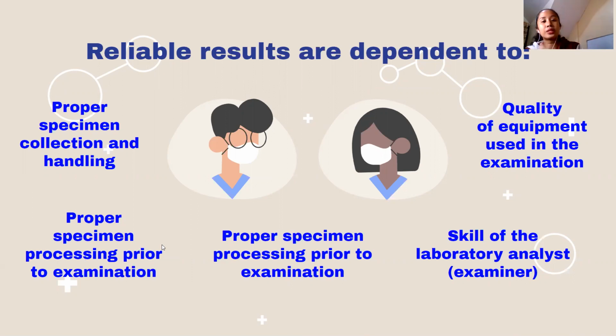What else? Proper specimen processing prior to examination. How much volume of stool do we need? Ganyan. Yung lalagyan ba, is it clean? Or contaminated pa rin ng Nutella, class? Ng cheese whiz? Yan lang.